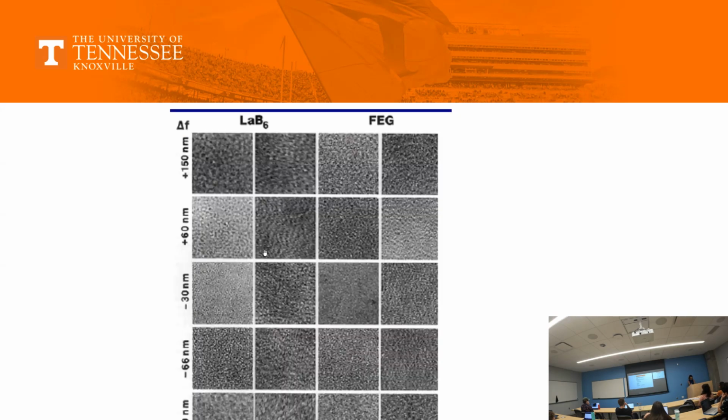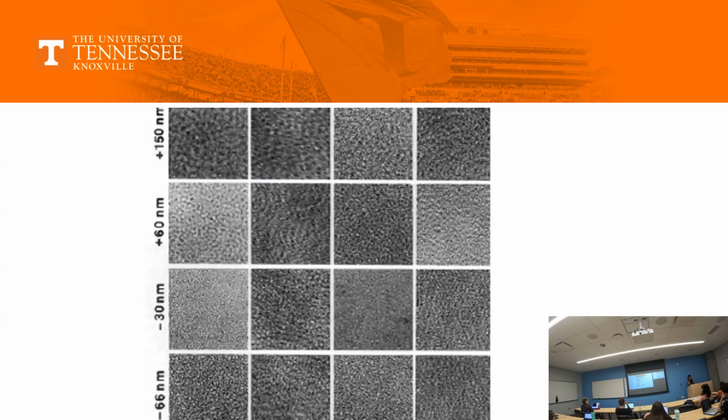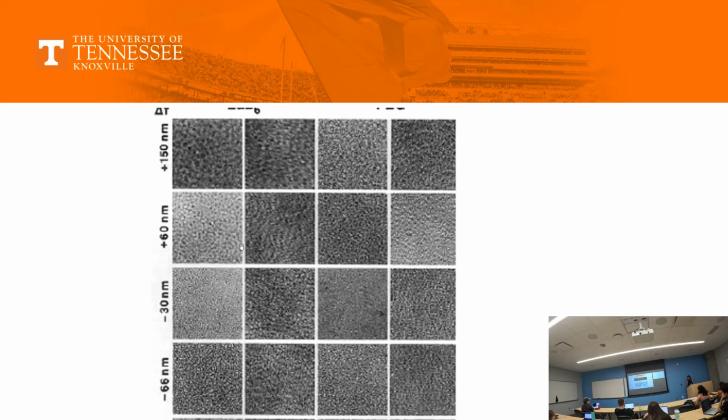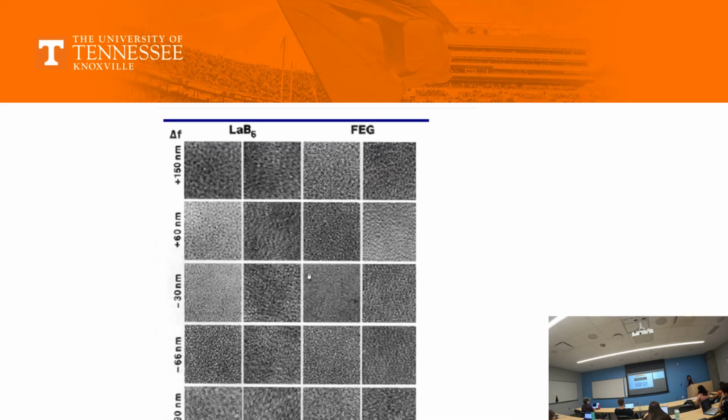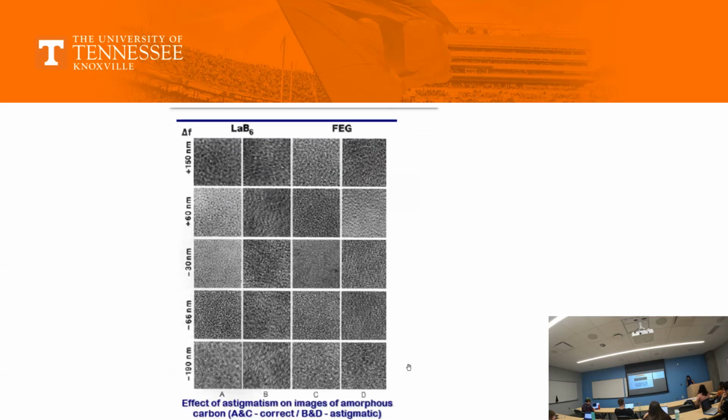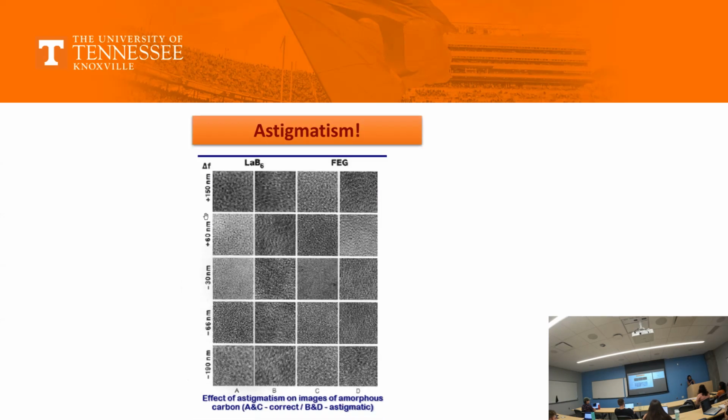Yeah. So you see all these, that's why microscopy becomes a bit tiring for the eyes. Some people think, okay, I should do it, but this is not good. Till the time you are able to see them sharp. This is wrong for me. This is wrong. For me, this is good. Right? So this is simply showing you LaB6 and FEG, the different effect of astigmatism at different focus. So you play with the astigmatism button and play with different focus.